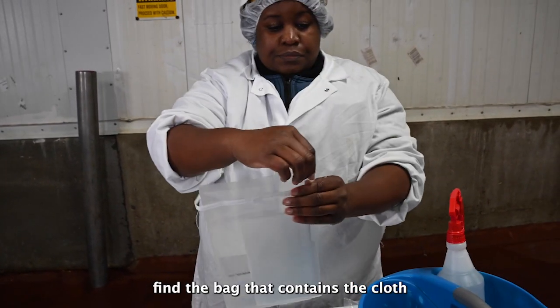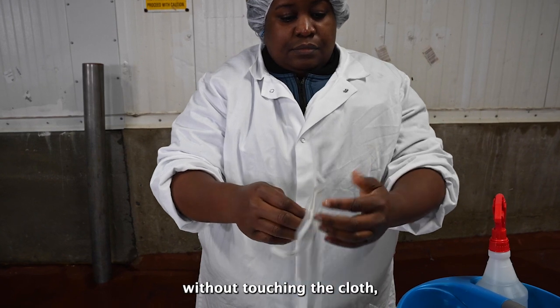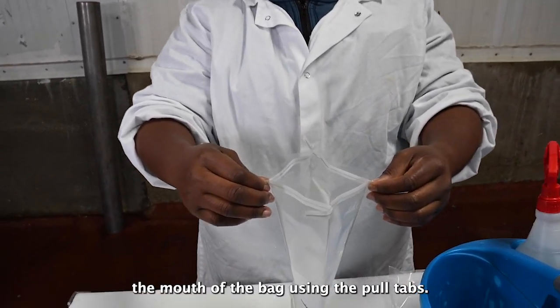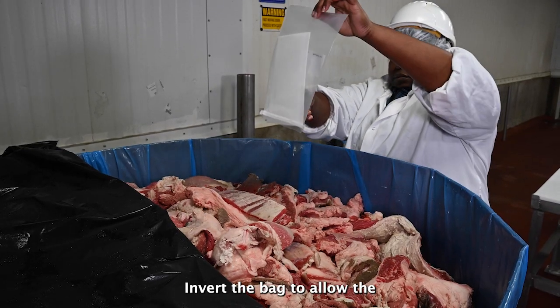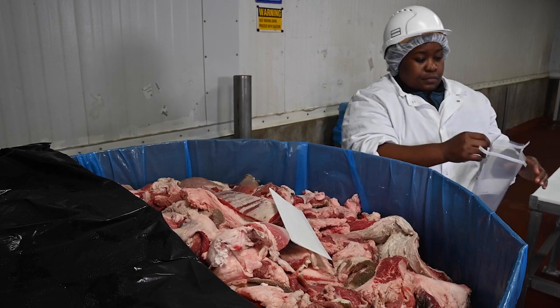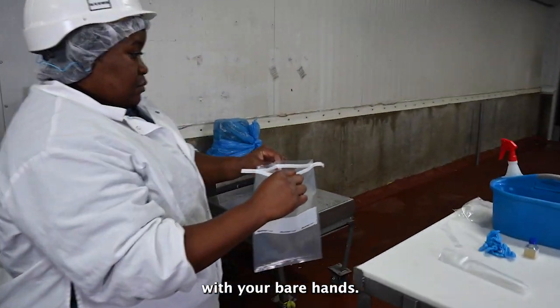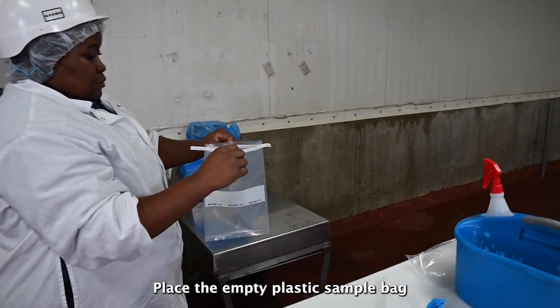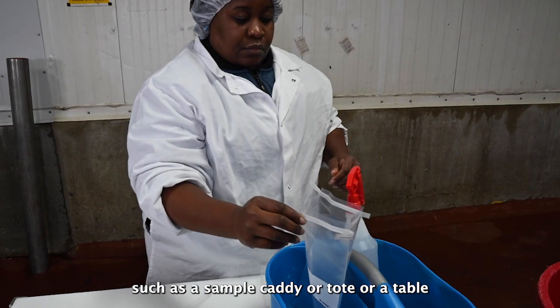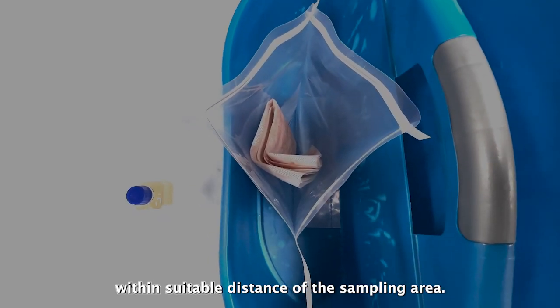Find the bag that contains the cloth in your sampling supplies. Without touching the cloth, tear open the bag and widen the mouth of the bag using the pull tabs. Invert the bag to allow the dry cloth to drop onto the surface of the product. Do not touch the cloth with your bare hands. Place the empty plastic sample bag in an upright position on a clean, sanitary surface such as a sample caddy, tote, or table within suitable distance of the sampling area.